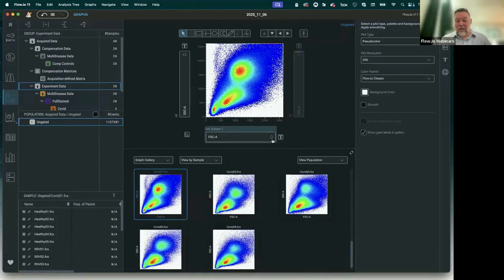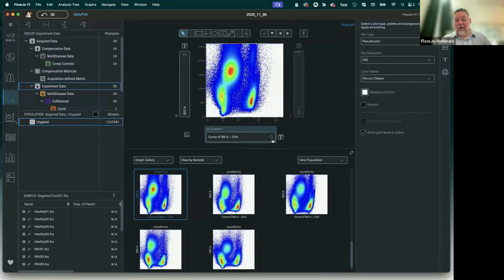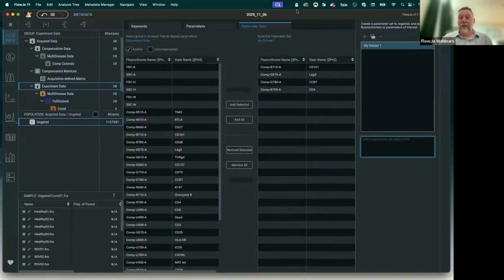And if I want to, I can advance through these parameters using hotkeys now, right, to display the data for that subset of parameters, going up or down. Right? Without even clicking and choosing the parameter. So that's the benefit of parameter sets. Highly recommended.